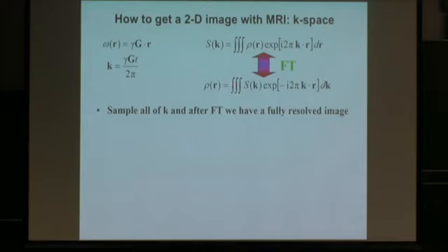And so what this is saying is that if we take our signal acquired as a function of k, remember we can apply a different gradient as a function of time, it's an experimentally controllable parameter, and do the Fourier transform, then we extract rho as a function of r. So rho, that's the spin density, the concentration as a function of position. That is what is more normally thought of as an image. It's just intensity as a function of position. So all we need to do is sample s as a function of k, do the Fourier transform, and that extracts our image.